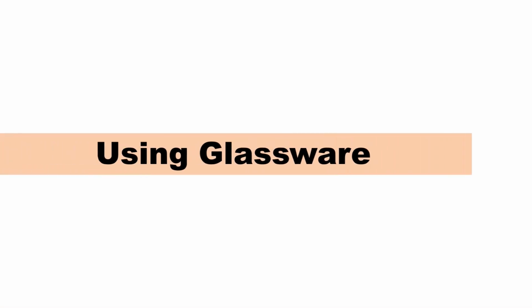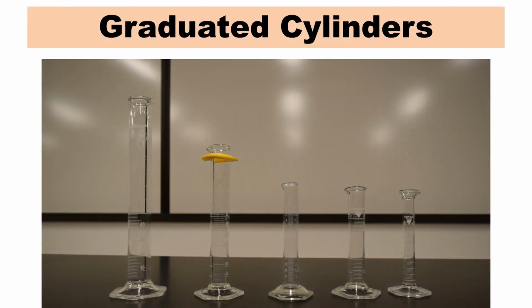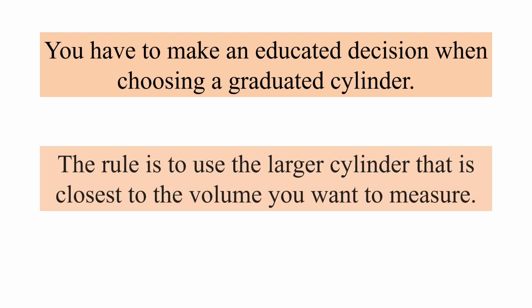In this section, let's practice using and reading the glassware correctly. I'll start with the graduated cylinder. Graduated cylinders come in various sizes. Our labs have 100, 50, 25, and 10 milliliter graduated cylinders, each with a specific graduation. You have to make an educated decision when choosing a graduated cylinder. The rule is to use the larger cylinder that is closest to the volume you want to measure.